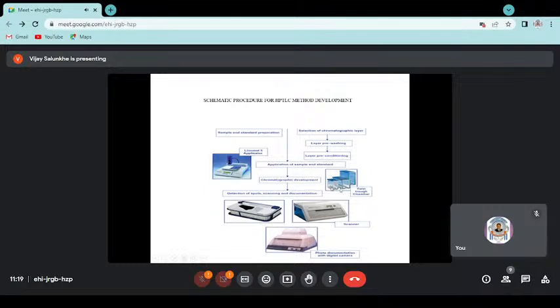After some time, you can remove that plate, dry it, and detect the spot. You can go for scanning in the TLC scanner, as previously described, and then you can get the photo documentation here. So this is in general the schematic procedure for HPTLC method development.